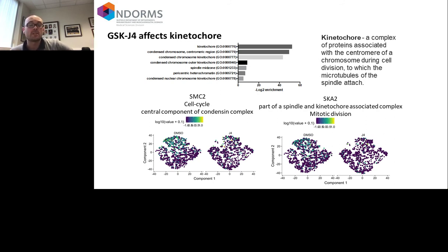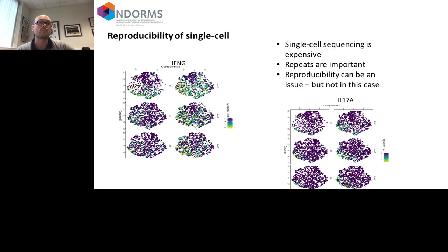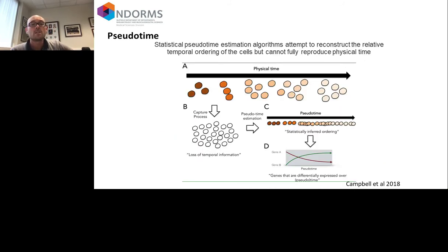As single-cell technology has matured and the method has become more routine, one of the things you really have to think about is that repeats are very important. I typically see quite a lot of variability within single-cell repeats. Thankfully, in this experiment, we didn't see any significant variability between the different treatments and the different repeats from the different samples. But from analyzing lots of single-cell sequencing data sets, this is an issue, and it should be a consideration whenever you set up any single-cell sequencing experiment. Because we have per sample transcriptome information, one single-cell tool that I find really useful for studying biology is the application of trajectory inference or pseudotime.